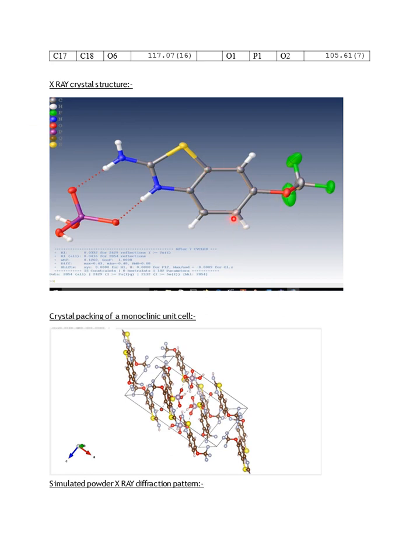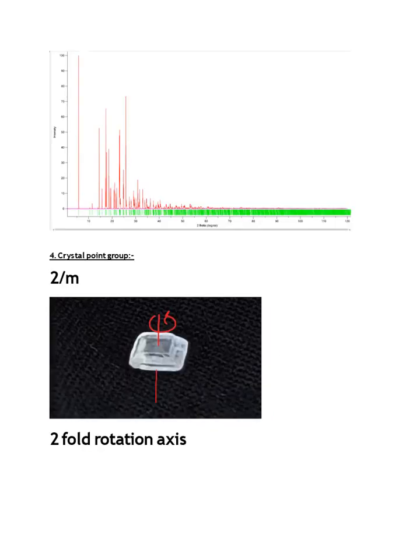Here, same as before, gray color represents carbon atom, yellow represents sulfur atom, blue represents nitrogen atom, white represents hydrogen atom, and these 3 green color atoms represent fluorine, and this magenta color atom represents the phosphorus atom, and here the hydrogen bonding exists as shown in the OLEX2 software. And then again we have performed the VESTA software crystal packing of this monoclinic unit cell. Here are some snapshots of the crystal packing that we have done by using the VESTA software.